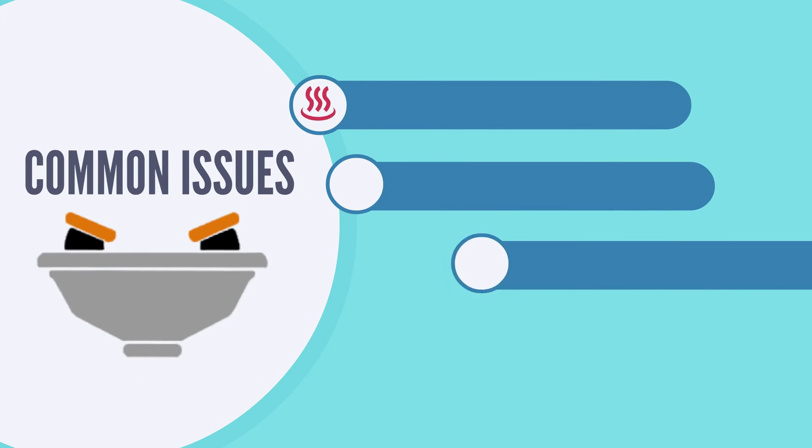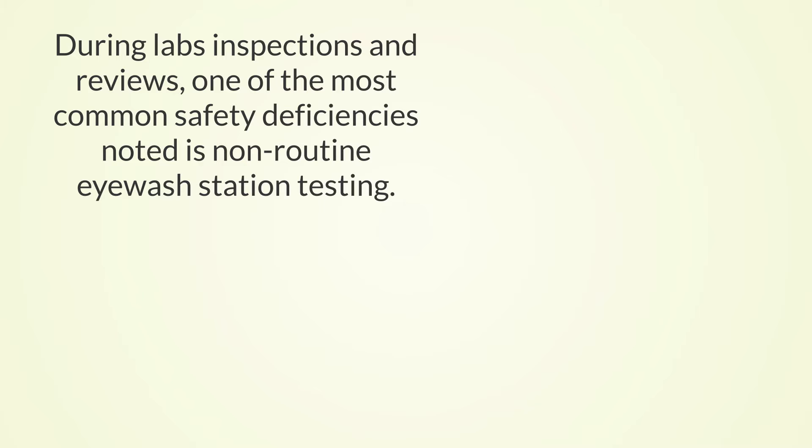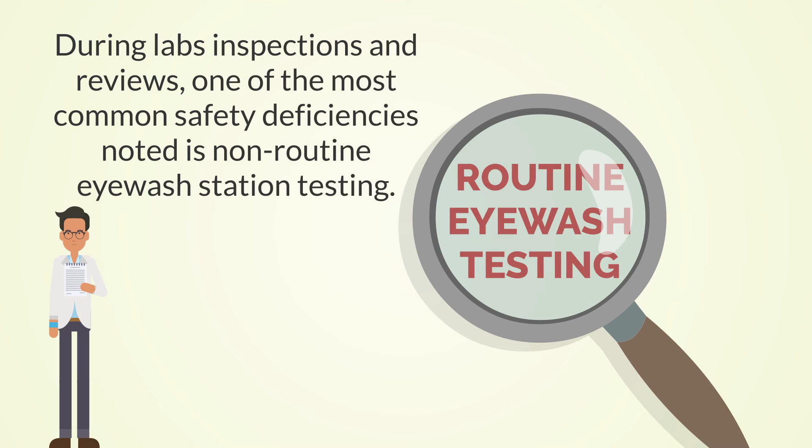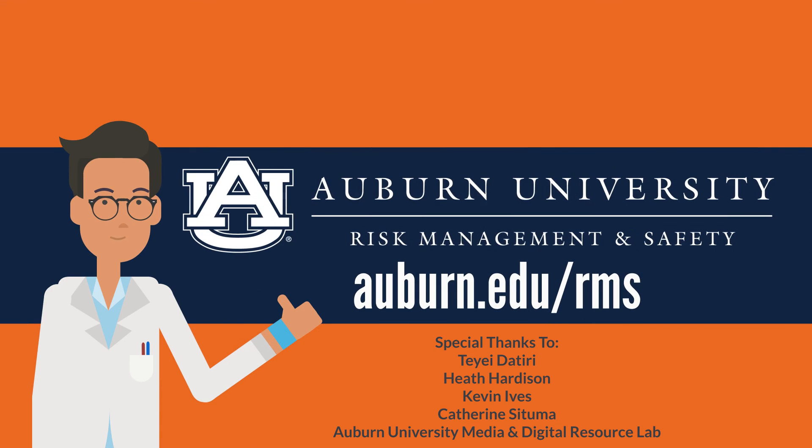Some common issues include water being too hot, water not clearing after several flushes, water appearing discolored, and damage to the unit, such as broken covers or cracks. Eyewashes are one of the most common deficiencies found during lab inspections. We often overlook eyewash stations, even though they are very important to the overall safety of a lab. For more on eyewash safety, visit auburn.edu/rms.